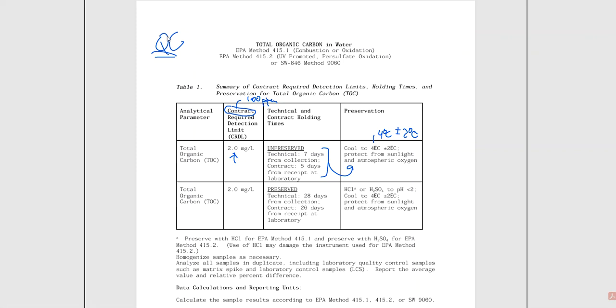And we're going to go in and write down the temperature at that moment in time. We're going to sign it, we're going to date it, and we're going to initial it so that they know who made that measurement. And sometimes it requires a double check. But this is a way that we are keeping track of our refrigerator temperatures. So that is a thing, believe it or not, absolutely. These are very important things because they are specifically laid out in some of the methods or the SOPs that we have to follow. So we've got to do it.